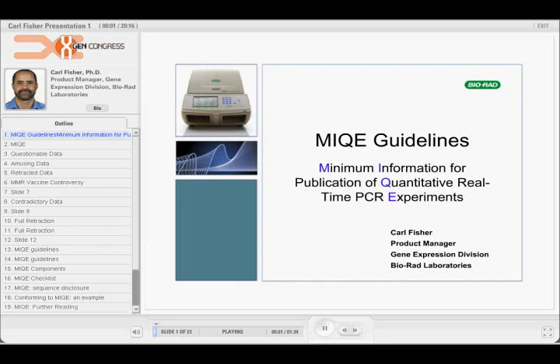So my name's Carl. I'm a product manager at Bio-Rad, and I'm going to be talking about two different things today. The first one is going to be MIQE and the MIQE guidelines. I don't know how many of you are familiar with it. You should become familiar with it if you're not, because I think it's going to be really important. It's going to be something that's going to be adopted in the near future. So I'm going to start off talking about MIQE, and then I'm going to go into high-resolution melting analysis afterwards.